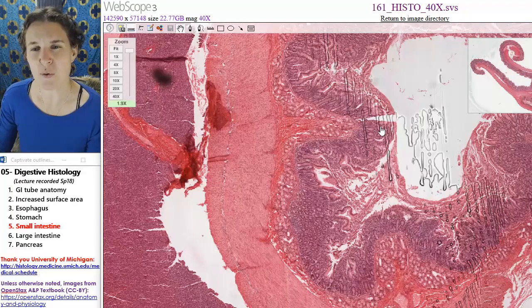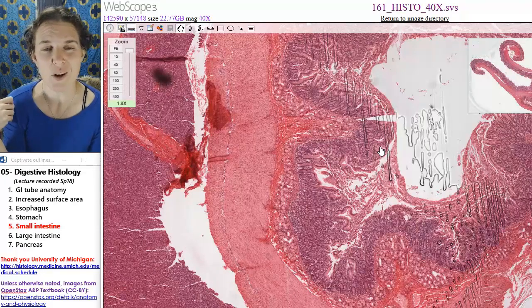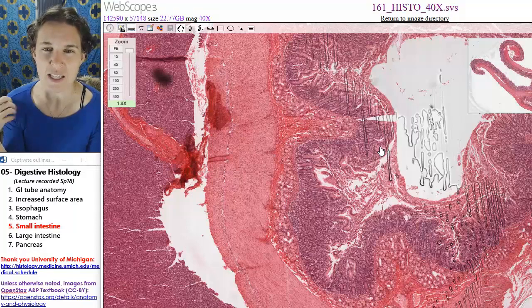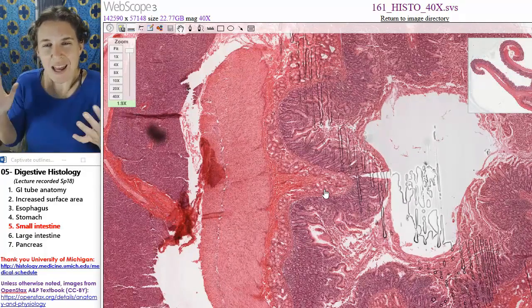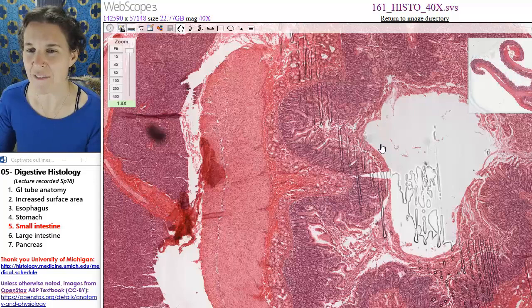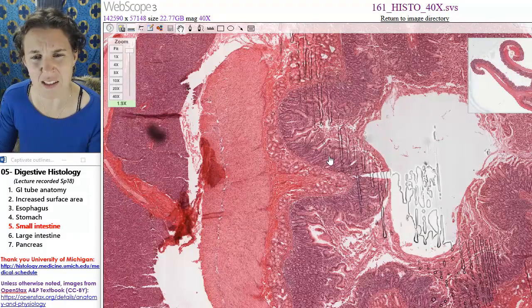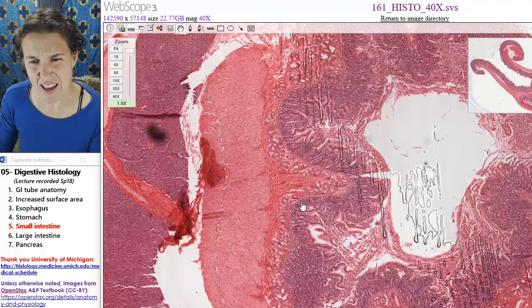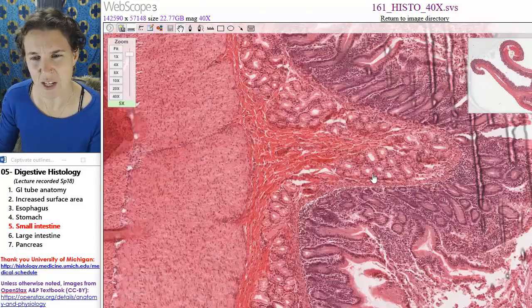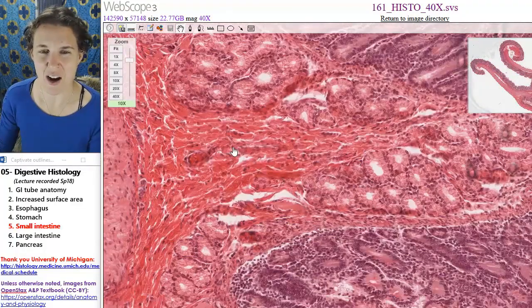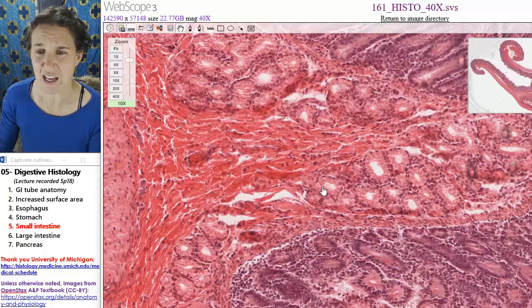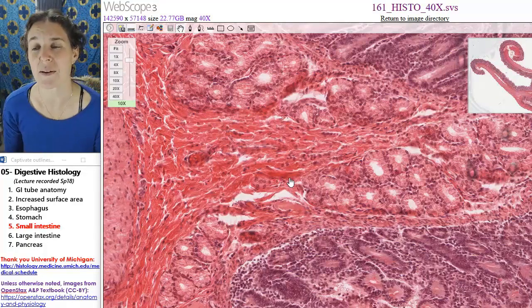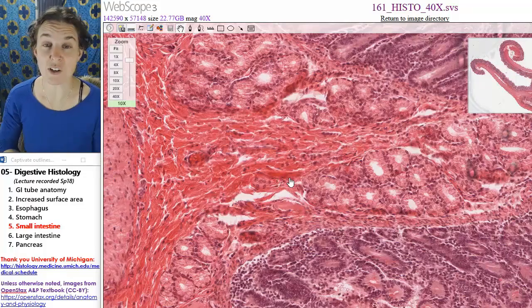I am going to show you the duodenal glands. I don't have a good slide of the Peyer's patches, and I'm just going to have to find one and show that to you. But check this out. I'm not even that close up in this slide. I found the lumen. This looks epithelial. And then it looks like, yeah, that looks like the mucosa has shifted into submucosa. And let's go check this out because glands, like right there. And this looks messy. This tissue definitely looks like dense, irregular connective tissue. And look at all those glands embedded in that submucosa.